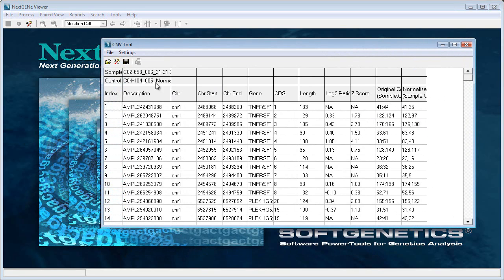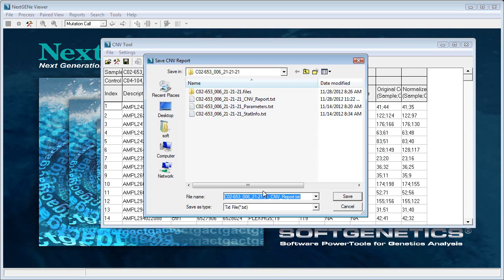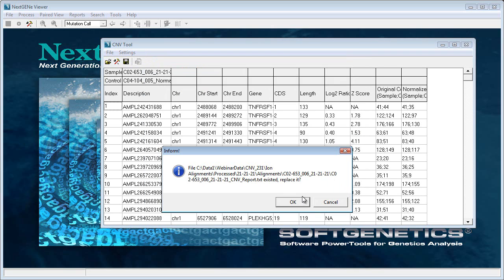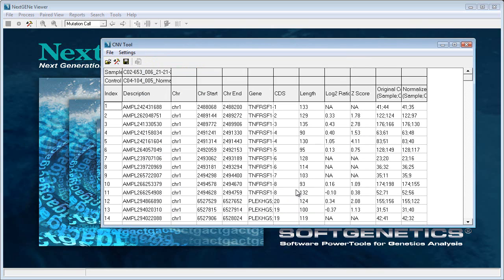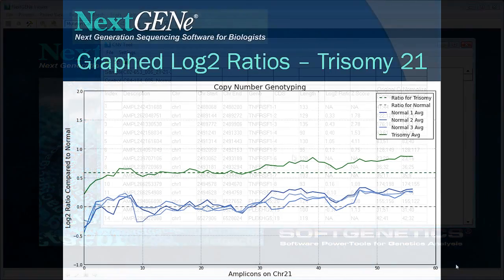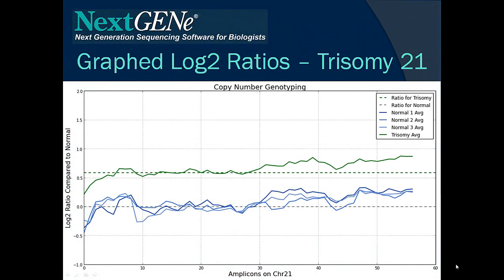Now I can save the report to a tab-delimited text file, which is very easy to open in other software and do some processing outside of NexGene. In this case, I loaded the data and processed it using a Python script.